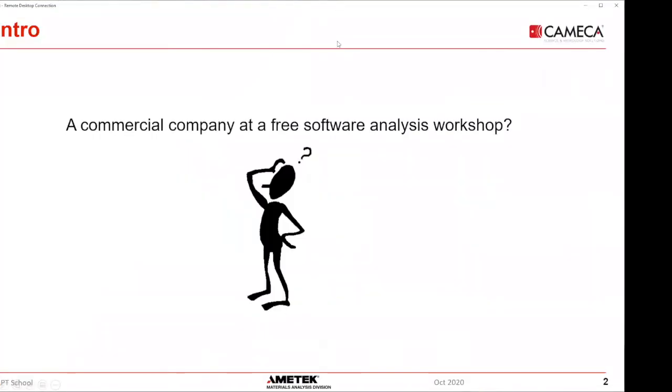So Peter, you basically gave the exact same intro that I was going to give, which is why we're talking about free software here. What is a commercial company doing?